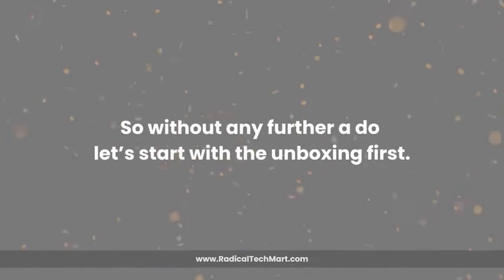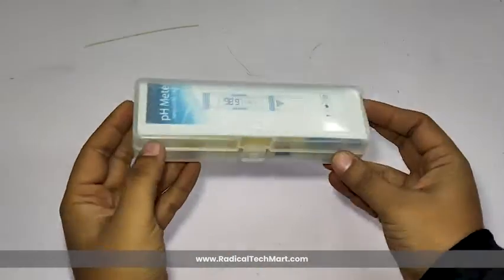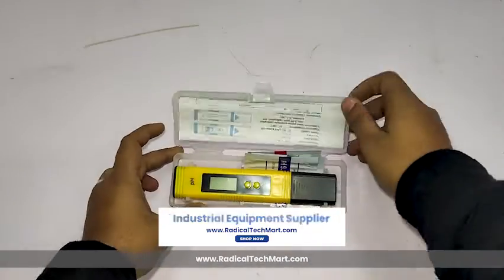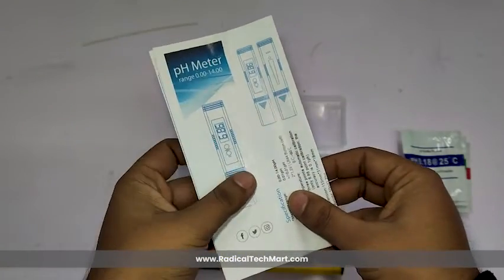So, without any further ado, let's start with the unboxing first. The pH meter arrives in a sturdy, transparent plastic case, ensuring portability and protection. Inside the box, you'll find the pH meter device, buffer pouches for precise calibration, and a user manual with detailed instructions.